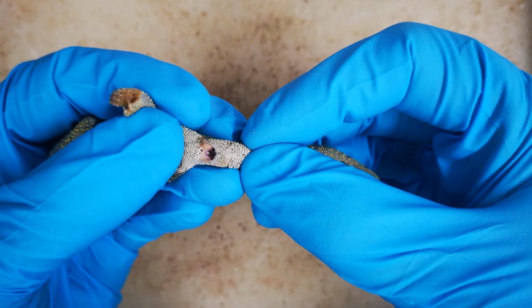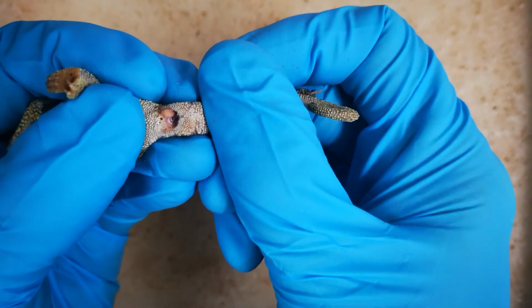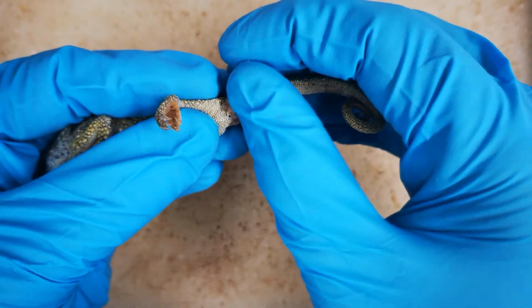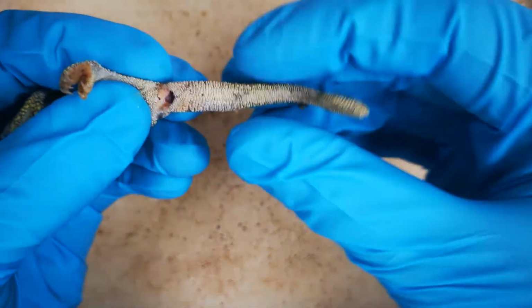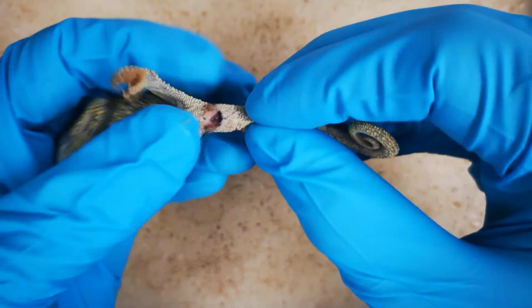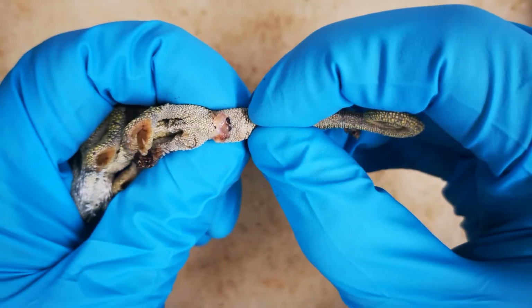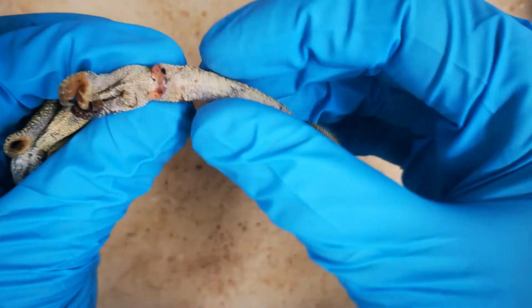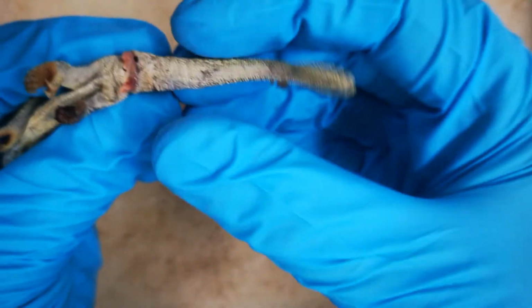First, locate the cloaca and the extent of the hemipeneal bulges. Pull gently with the holding hand, here the left hand, to expose the cloaca. To make it easier to prepare the hemipenes, it is important to prime them for expression. We do this by exerting gentle pressure at the posterior end of the hemipeneal bulge and rolling the finger or squeezing the fingers in an anterior direction. Here we can already see the base of both hemipenes being extruded. This will make the preparation much more likely to succeed.